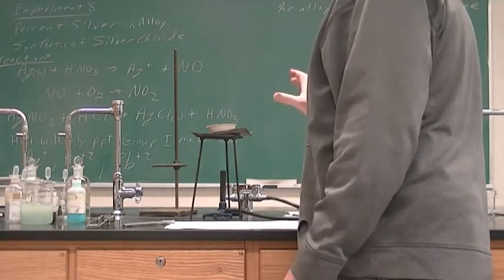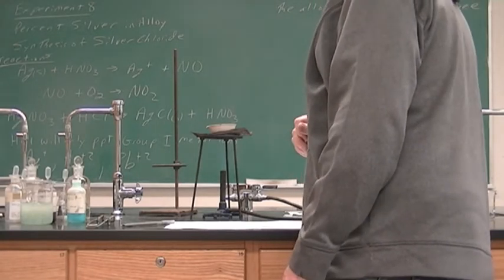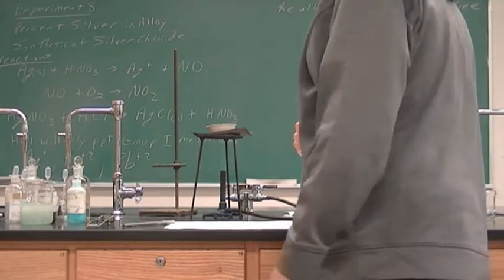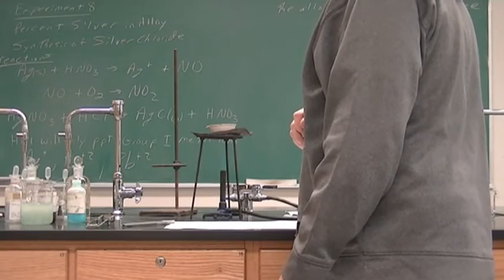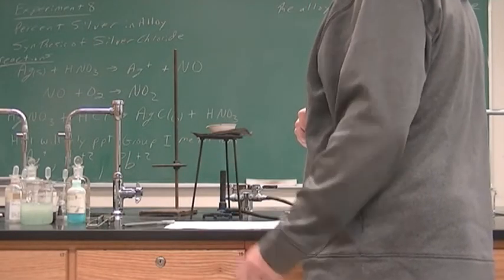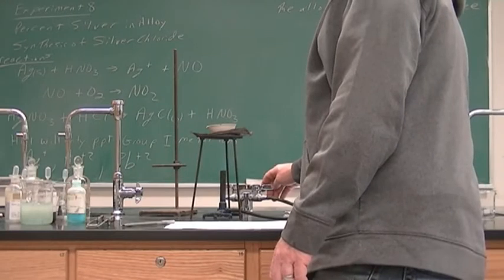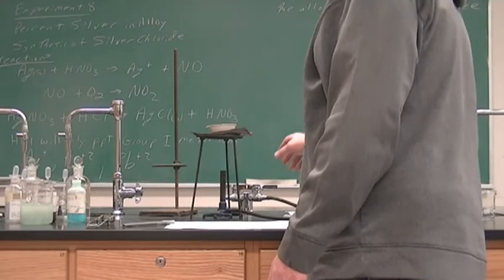So this is about the volume we should have started with. A very small amount of water inside there, and then boil that out. This is where you have to be the most careful, though. That water gets underneath that solid, boils, and pushes that solid right out. And it's very difficult to turn it down low enough to boil it and not lose it.